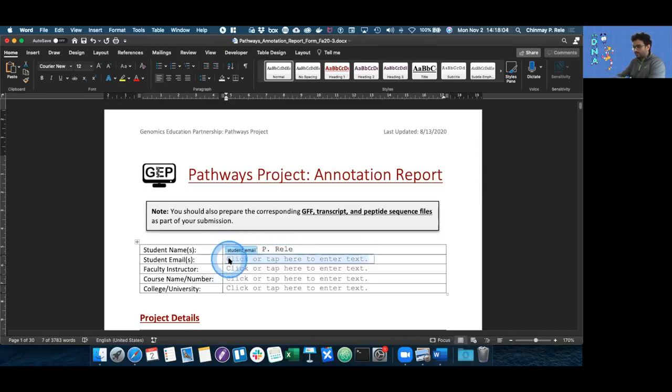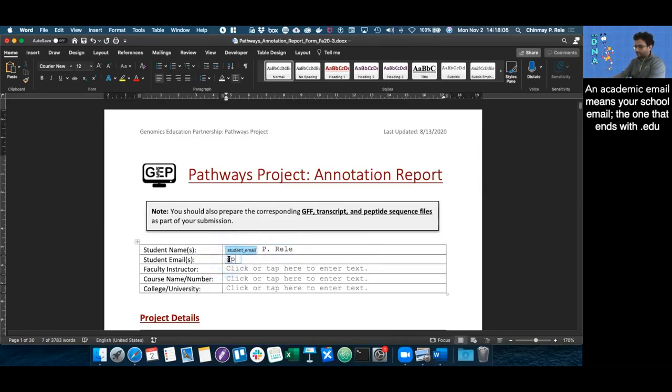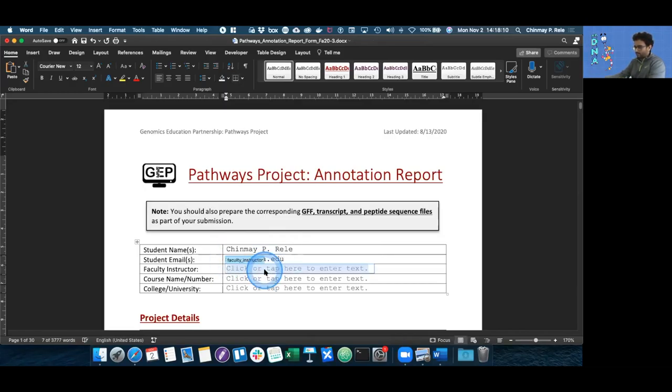Then we need our academic email which ends in dot edu, as well as our faculty instructor. In my case, it's going to be Dr. Laura Reed.